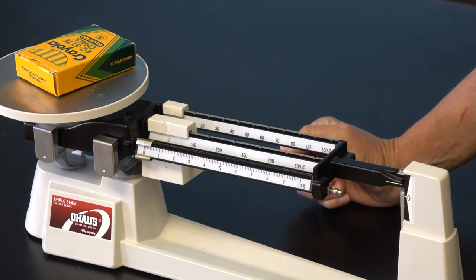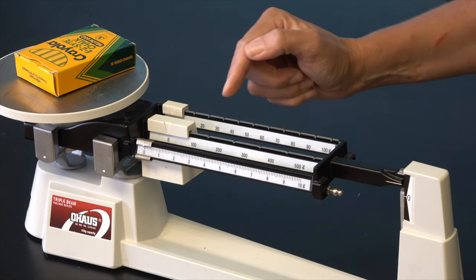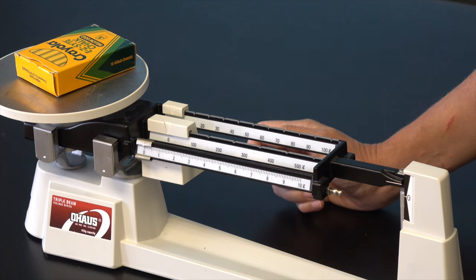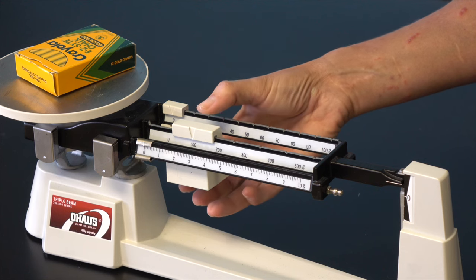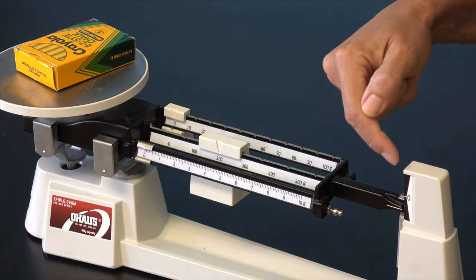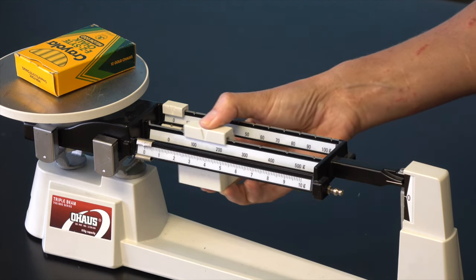Now we have to move the riders on our balance to increase the mass on the beam side. First, the rider with the most mass, the middle one, the 100-gram one, is moved. It's very important that this rider is always moved into one of these notches and not allowed to rest between notches. The rider is moved notch by notch until the pointer falls below the zero mark. Then the rider is backed up one notch.